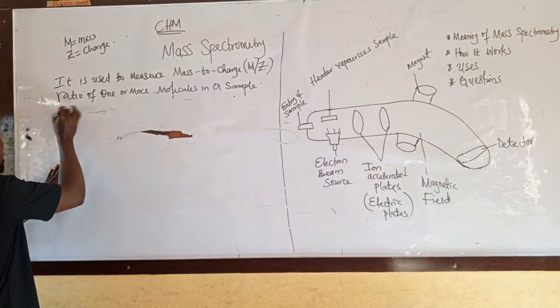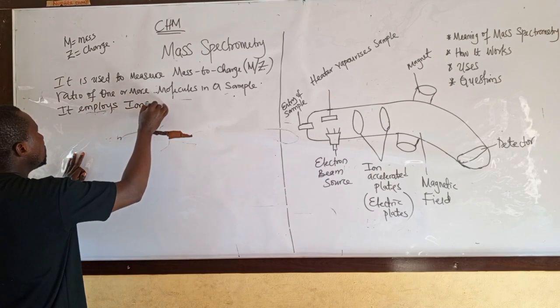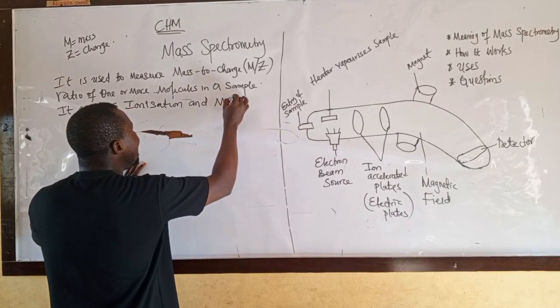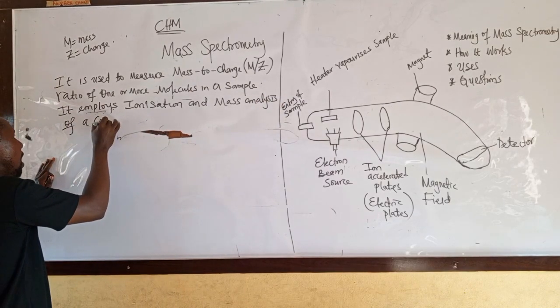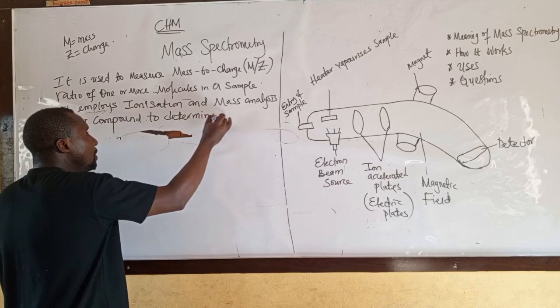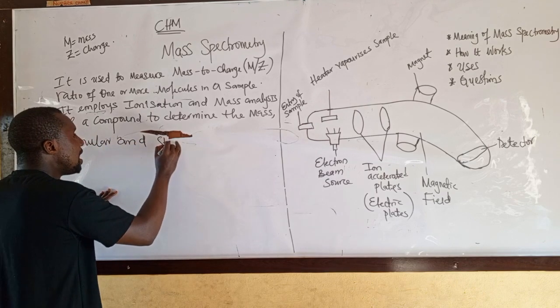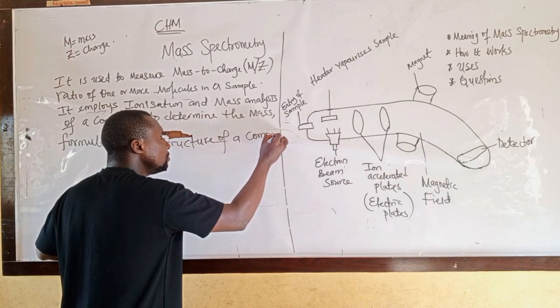Take note of this. The device employs ionization and mass analysis of a compound to determine the mass, the formula and the structure of a compound.